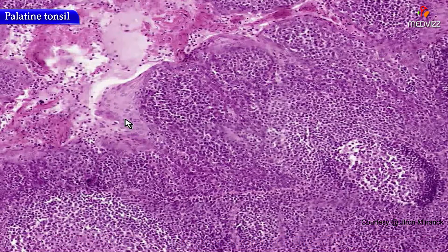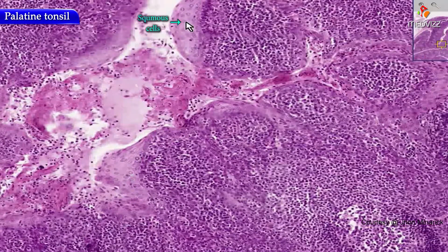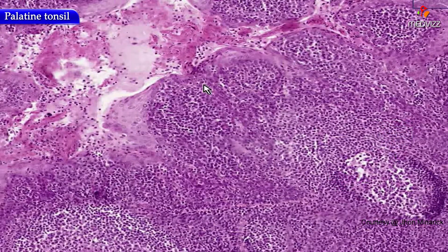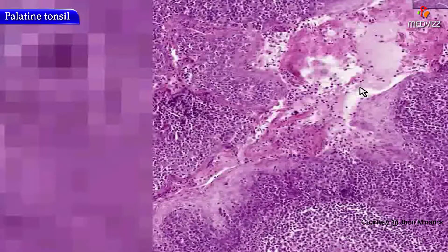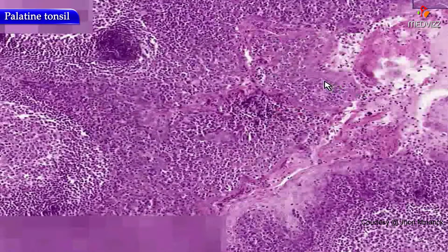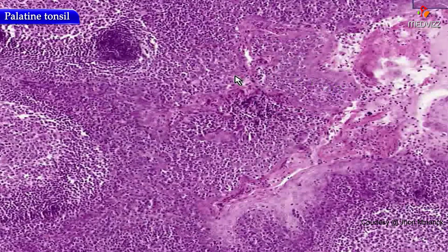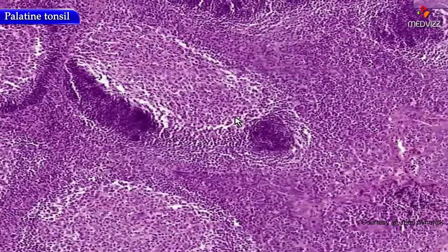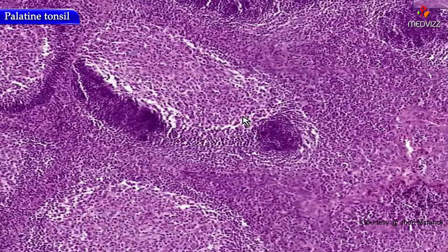Is there anything in this field you can't identify? Here are squamous cells, here are secondary lymphoid follicles, here are germinal centers. Really, I can't think of anything other than what we just said that defines the architecture of a tonsil.